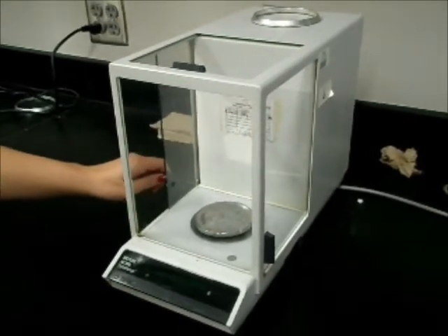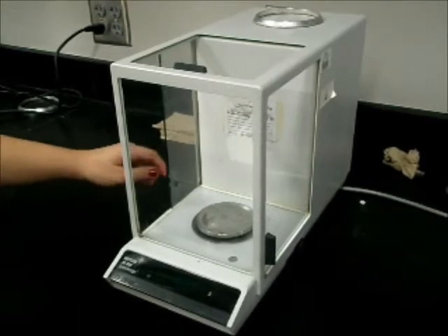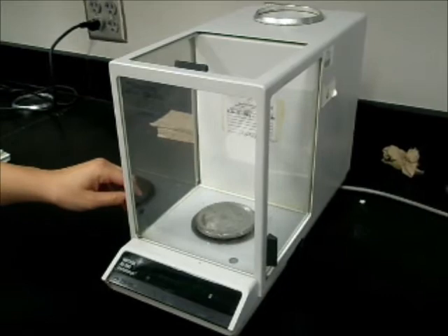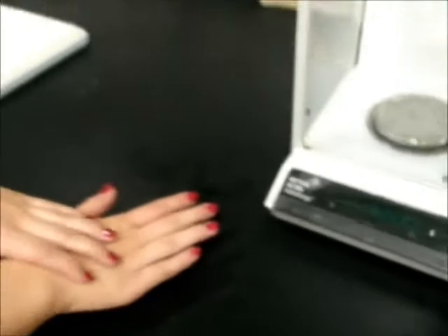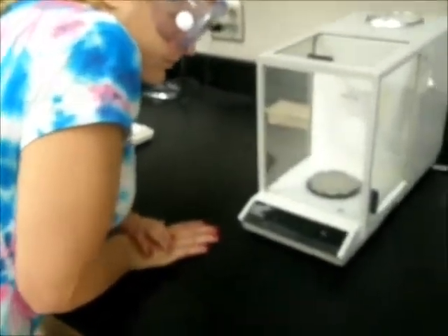This is because the analytical balance is hypersensitive. To prevent this, one must make sure to close the doors of the balance to avoid external pressure because it will skew the data. Also, avoid leaning on the table while using the balance because it will adversely affect the measurements due to more external pressure on the balance.